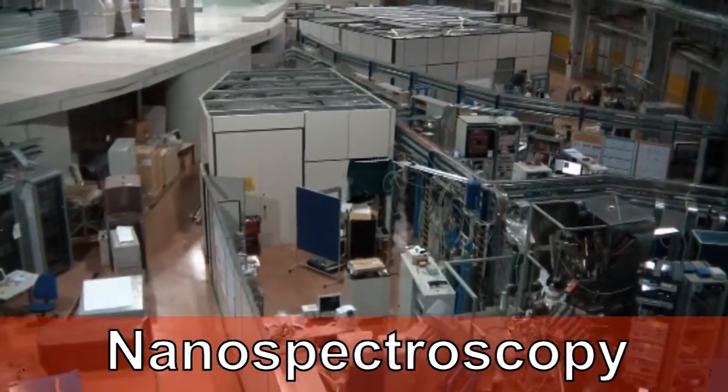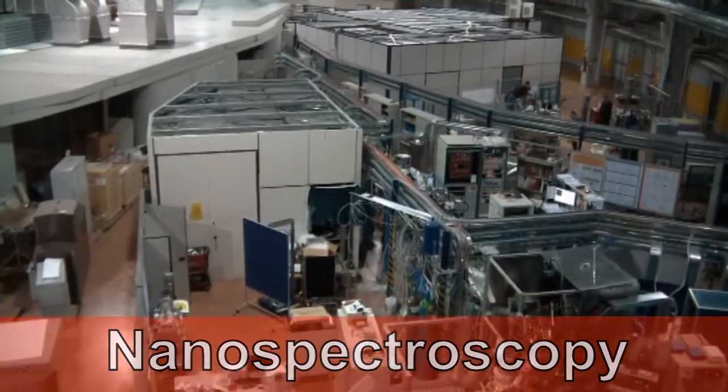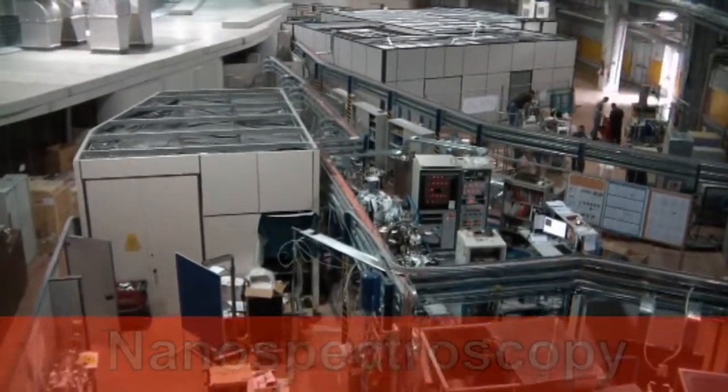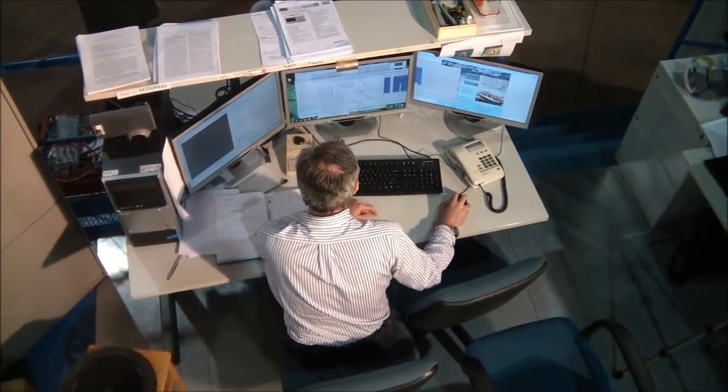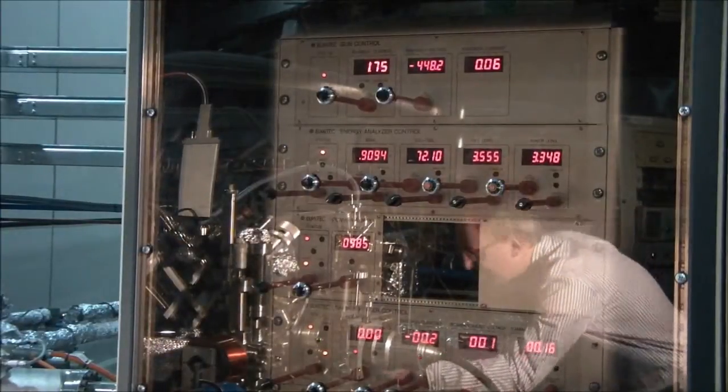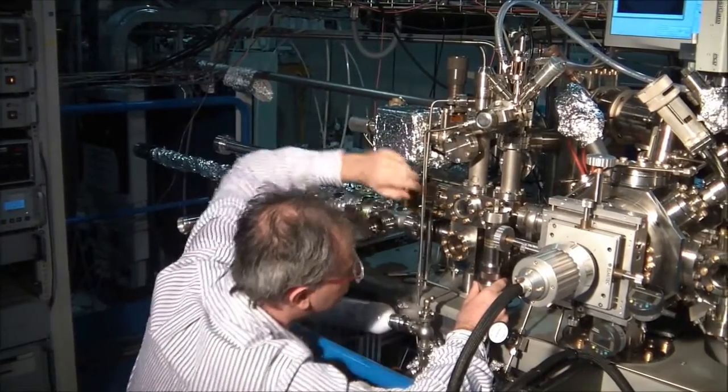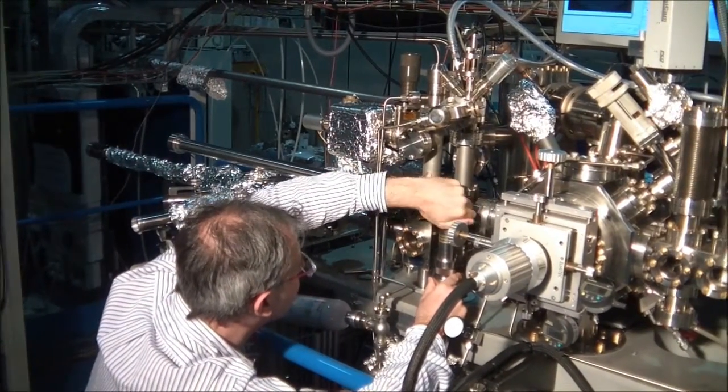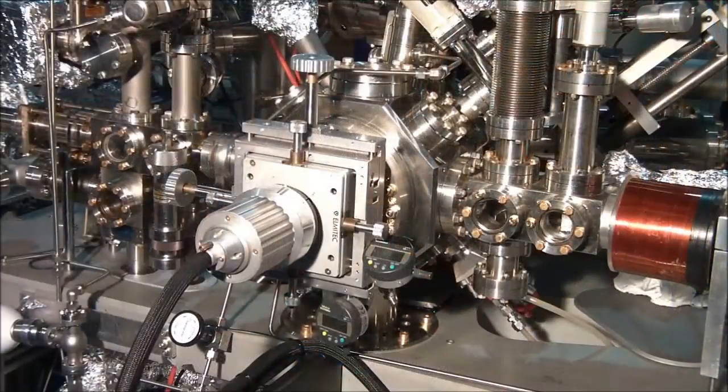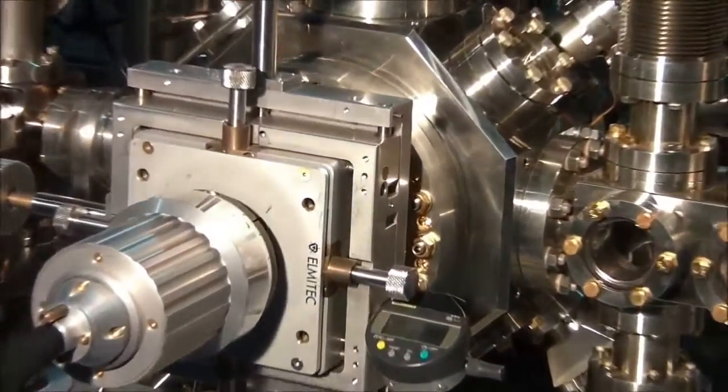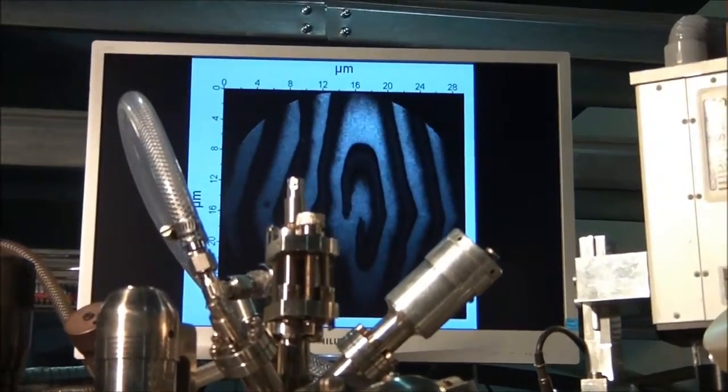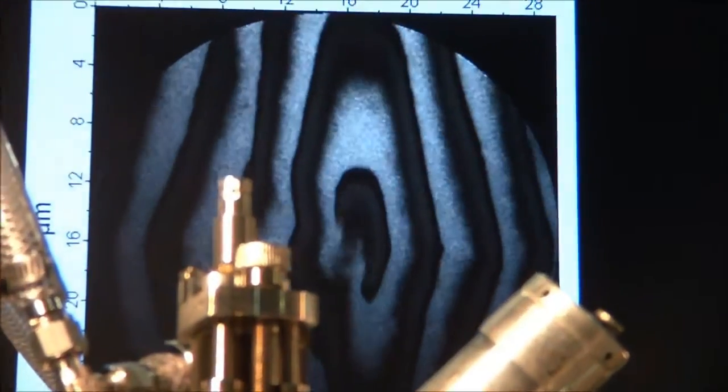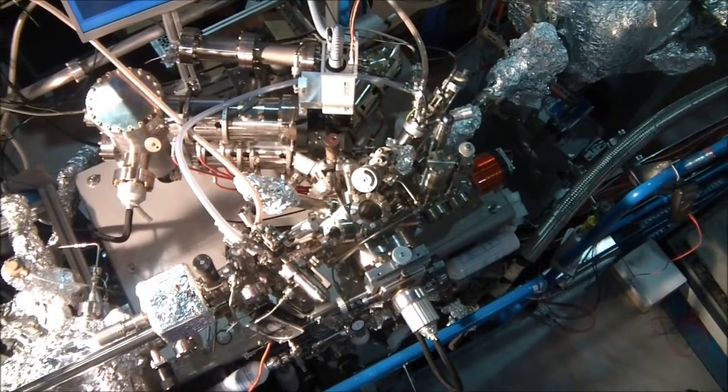The nanospectroscopy beamline at Elettra operates the SPELEEM, a powerful end station for the analytical characterization of nanostructured materials and composite interfaces, combining X-ray photoemission with low-energy electron microscopy. The SPELEEM offers the widest range of analytical investigation methods for structural, chemical and magnetic characterization of surfaces and interfaces, used to perform conventional X-ray spectroscopies in a laterally resolved manner.